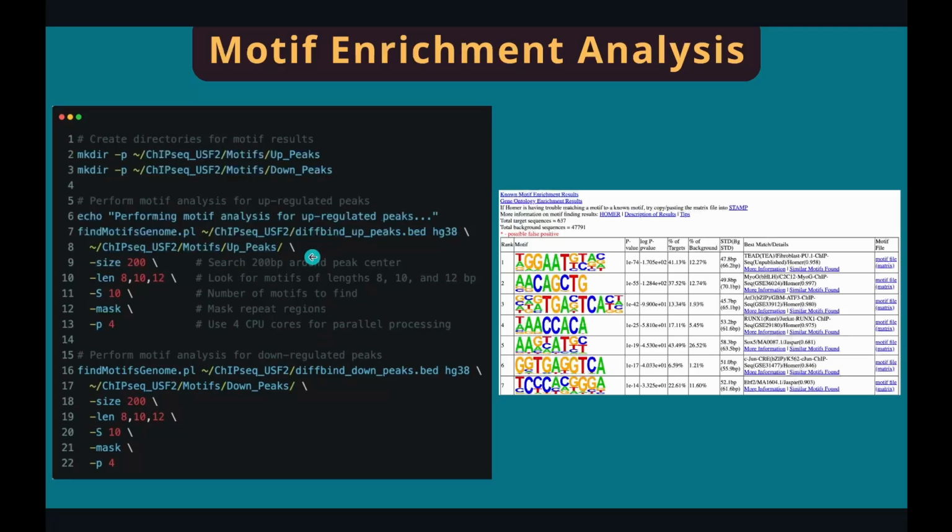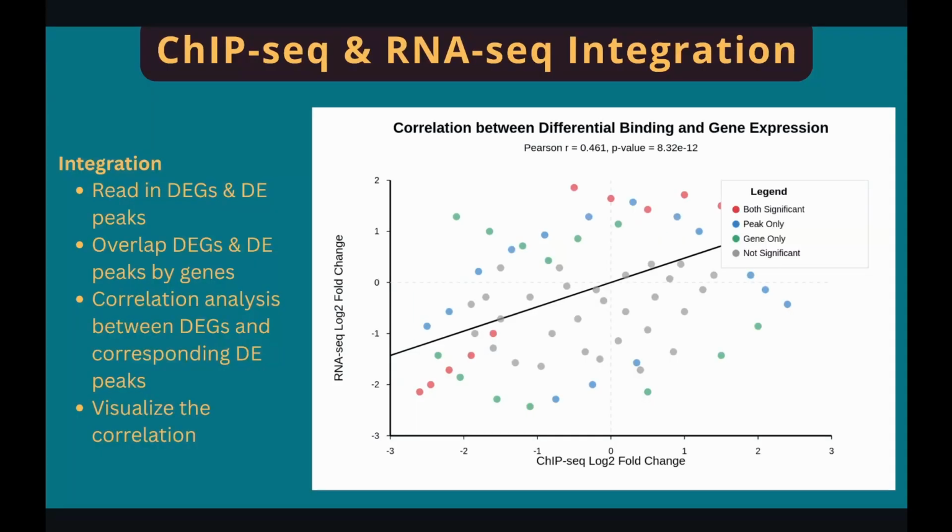In each output folder, you can find an HTML file where the results are stored. Open the file with your web browser to visualize the results. All the links are clickable.